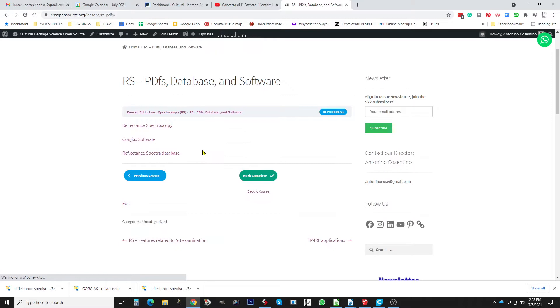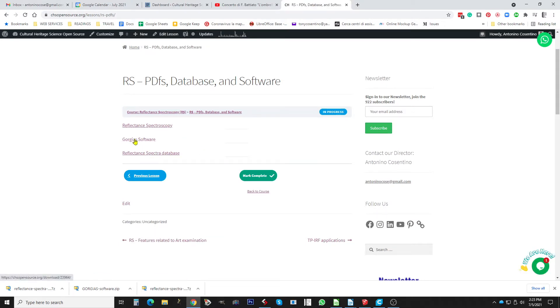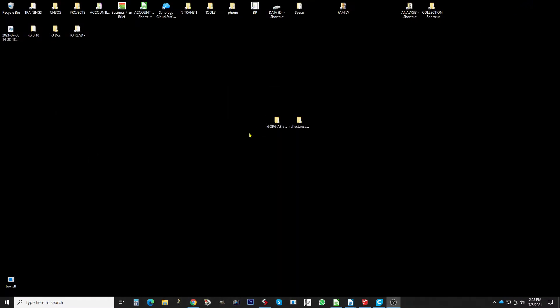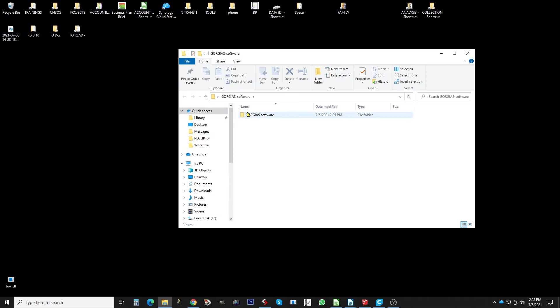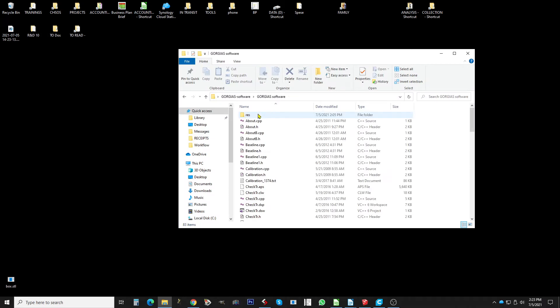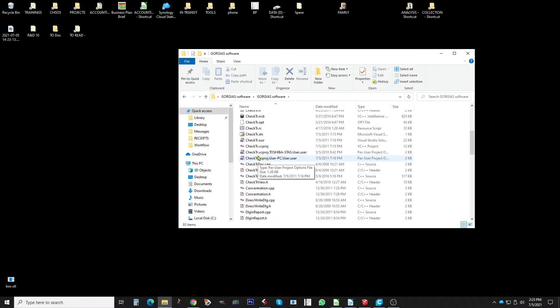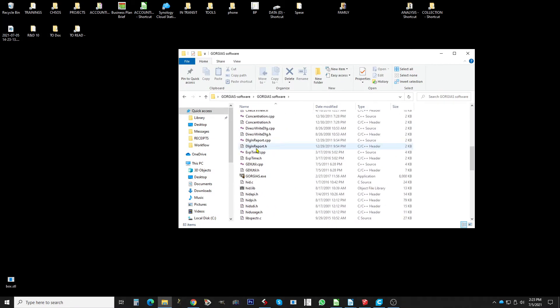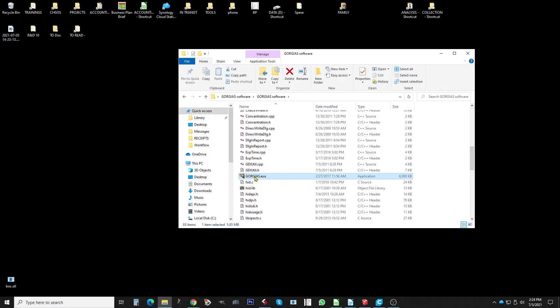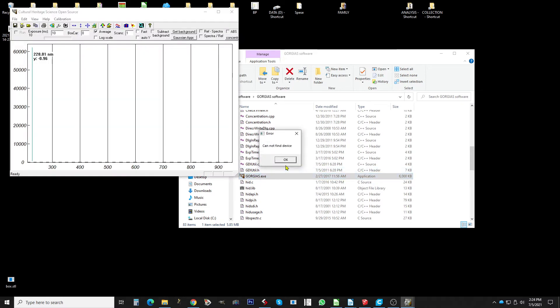Then you can download reflectance spectra database. So we click here, gorgeous software reflectance spectra database. We have already downloaded gorgeous software and the database. Gorgeous software, you just open the folder and here there is the gorgeous dot exe executable file. So you just click here and the software runs.